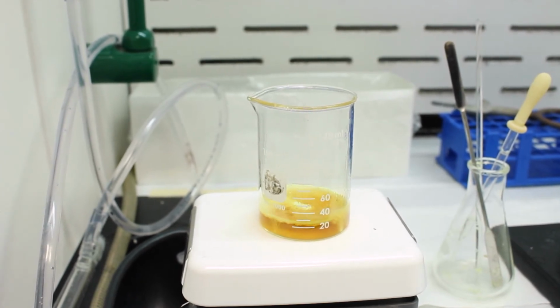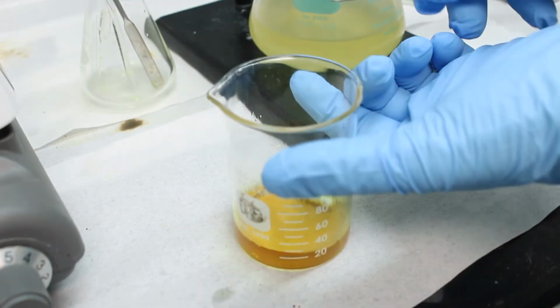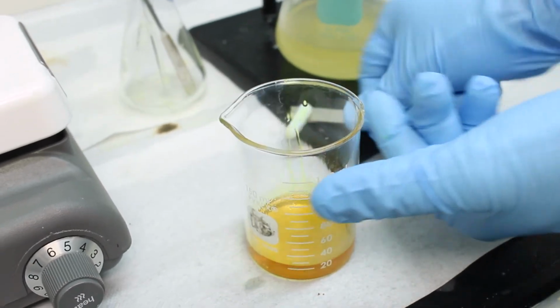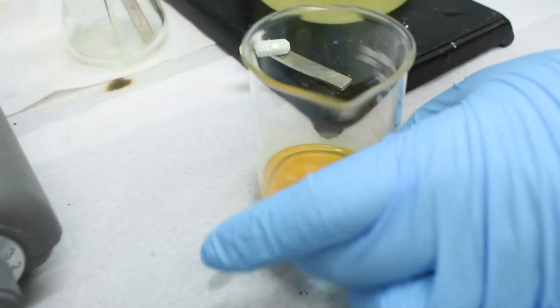Okay, so here we go. I'm going to remove it from the heat. I'm going to carefully remove the stir bar. Clean that after. And then here's our boiling chip.